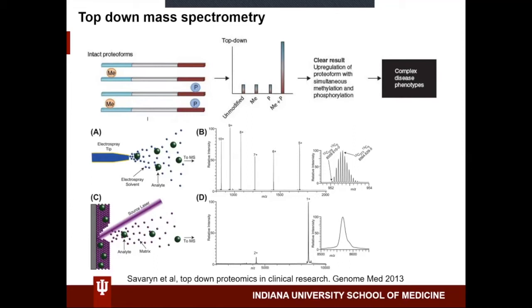But because of that, in addition to post-translational modifications, you could treat with a small molecule compound that's a covalent modifier, and then you could look to see what percentage of your protein is actually modified. So the quantitation for something like this is, I don't know what you think, Emma, but I think it's better than what you would get from bottom-up, just because you're looking at the full molecule, so you get the full picture of what percentage of different forms are modified.